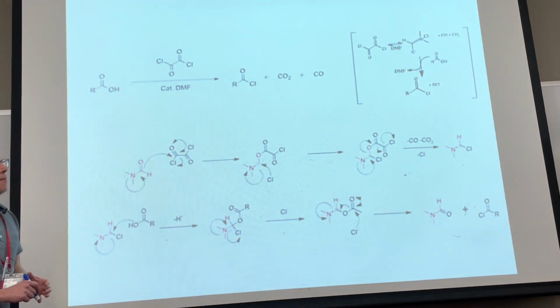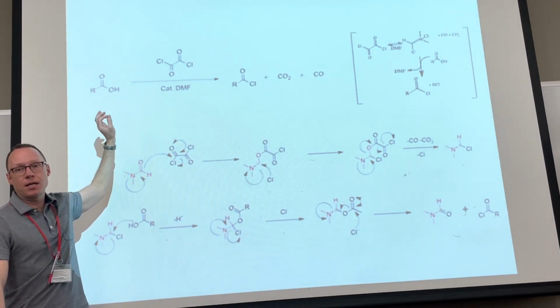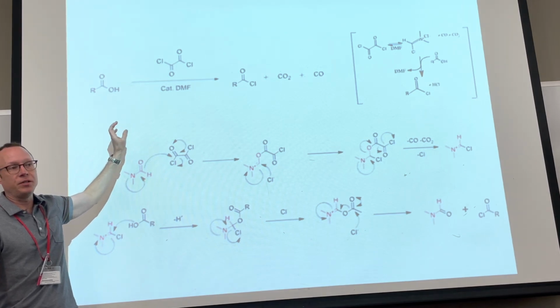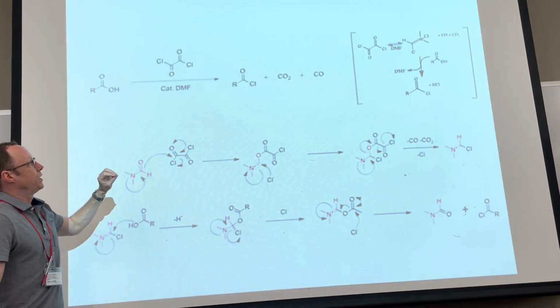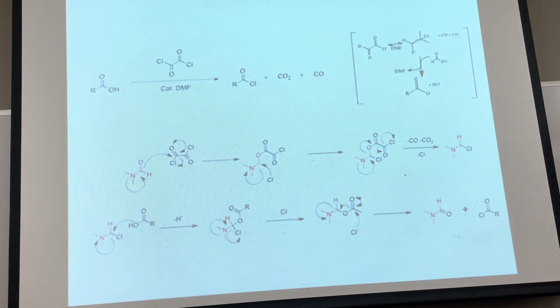But anyway, you're going to combine the carboxylic acid dissolved in hexane, I believe, with the oxalyl chloride. You're going to do all of this in the hood and then add just a couple of drops of DMF. That's all you need. That will be a little bit of a vigorous step. Leave that in the fume hood to react. So what I'll probably do is just get a stir plate and set it in the fume hood.